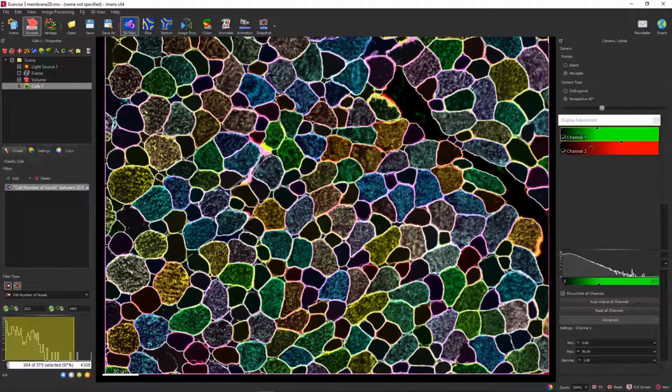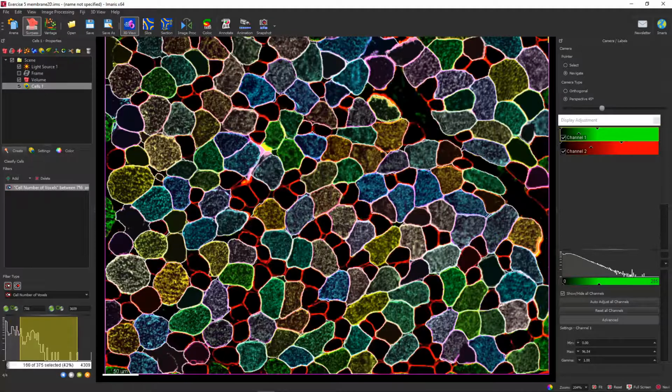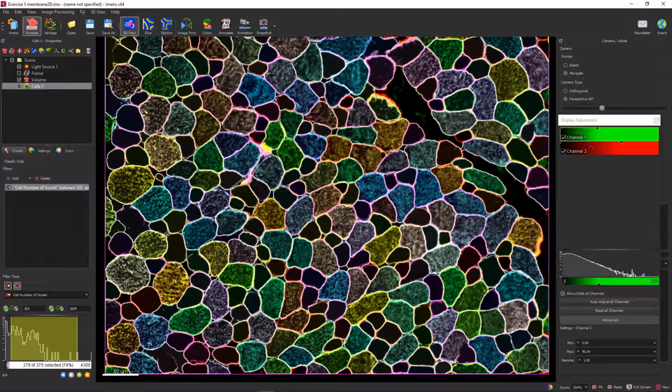If there were some very small one, that would be the left part of the slider. When you are moving with the sliders in these histograms, you use the right mouse button for the right part of the histogram and the left mouse button for this line.